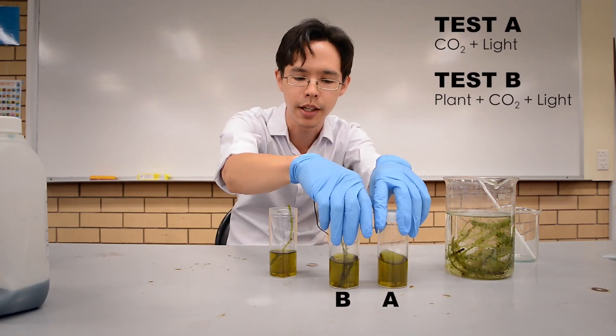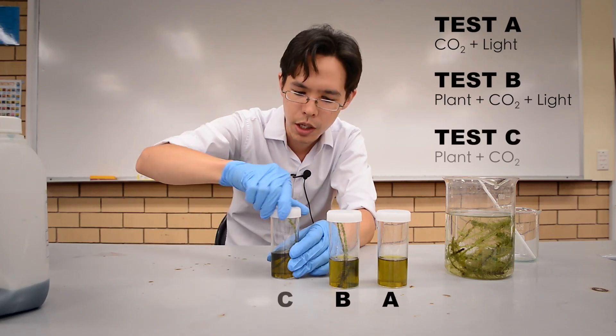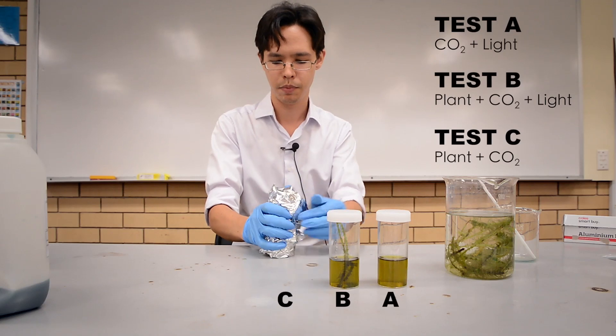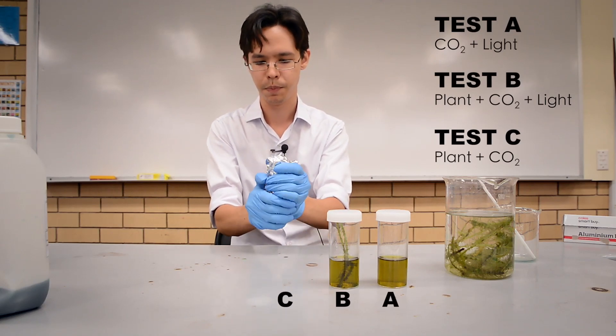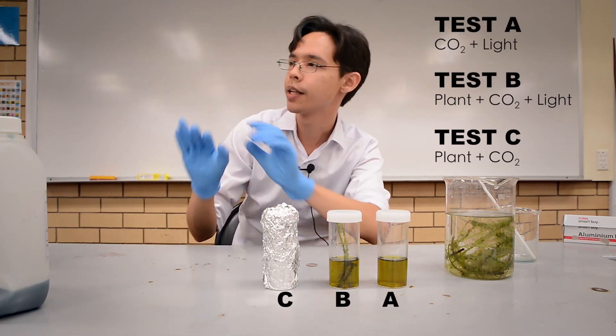This will be our control, which has just the solution, and we want to see how quickly the carbon dioxide will leave the water, how quickly it will effervesce. The next one, we will seal it in the container with the plant inside, and this will be set into the sunlight. And the last one, we're going to do the same thing in the sun, but we're going to cover it with aluminum foil to protect it from sunlight.